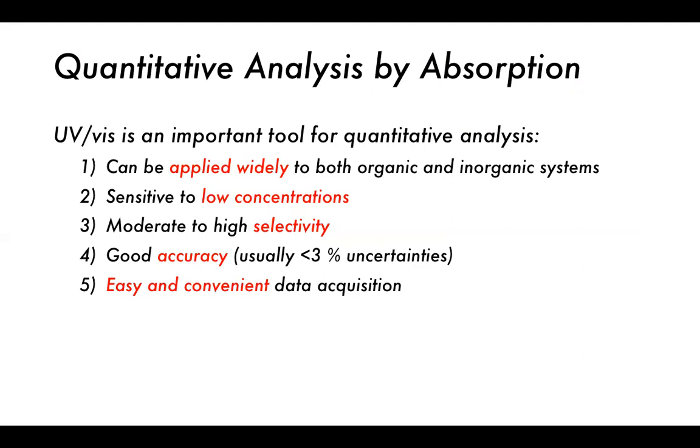So quantitative analysis is usually the major application of UV-Vis absorption spectroscopy. Typically, what we're looking at is the best way to measure these samples. How can we get a concentration usually, or a ratio of concentrations between our components or our analytes in solution. UV-Vis spectra are usually broad, complicated by vibrational and rotational lines, as well as our electronic transitions, which is really the effect that we're making use of.